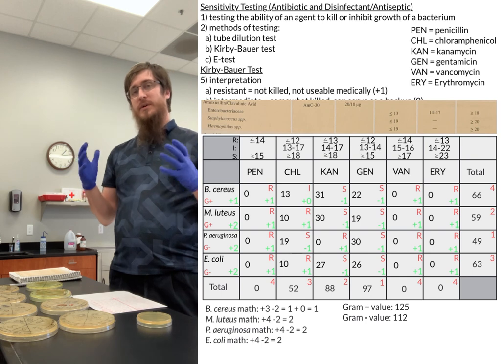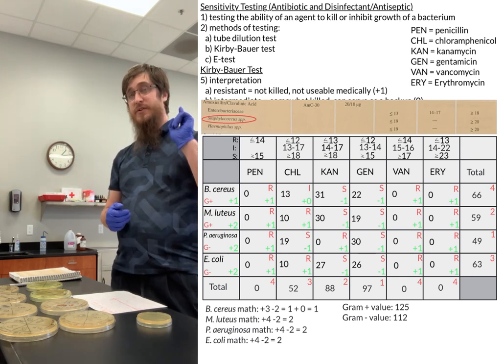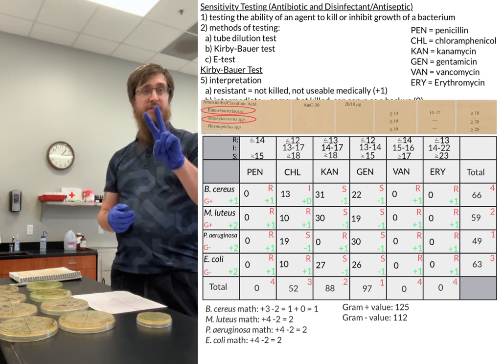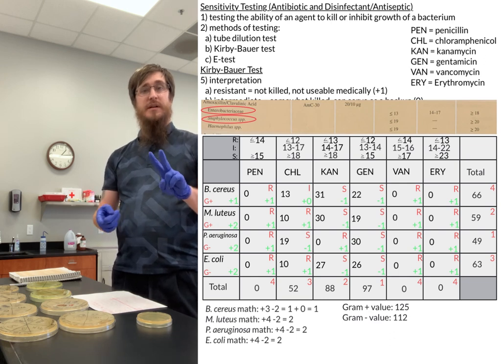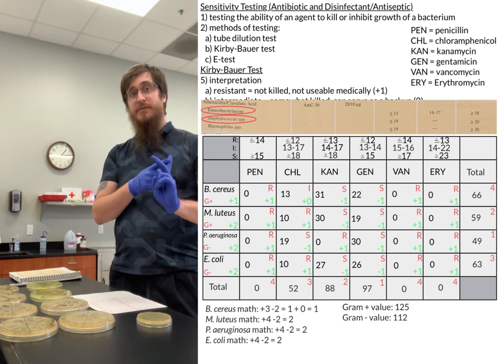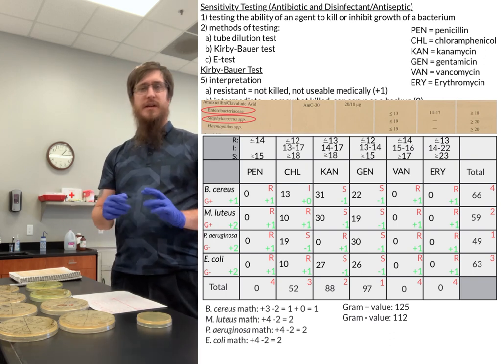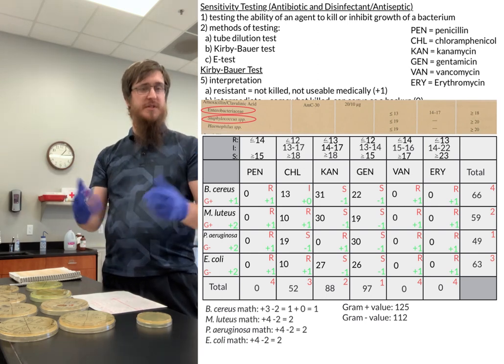For our class, we are either going to use a Staphylococcus, and if it is not a Staphylococcus species, you can consider it to be an Enterobacteria species. So if it indicates that it's a staph species, use the staph numbers. If it's not a staph species, use the other numbers, the Enterobacteria group. That will make it nice and consistent across the board in terms of how we interpret the specific data that we have.